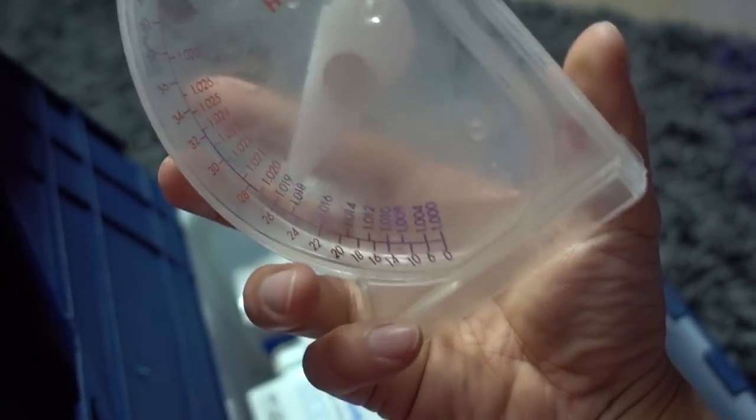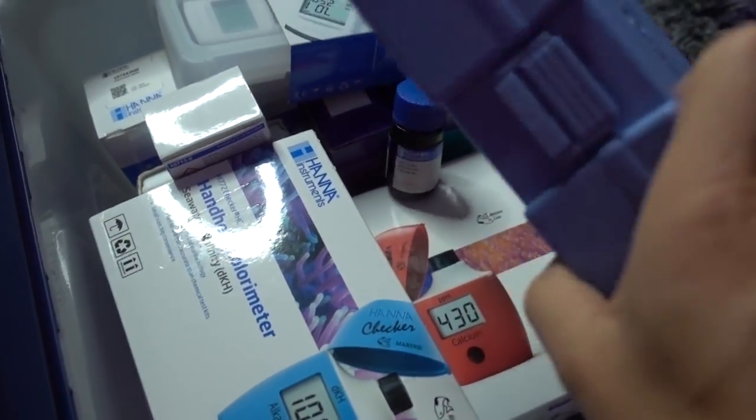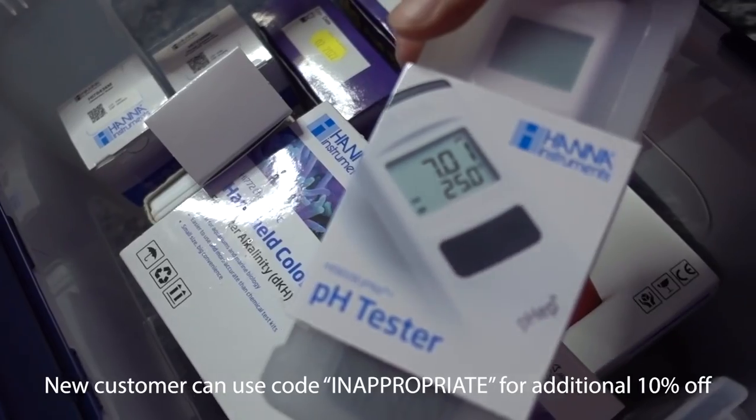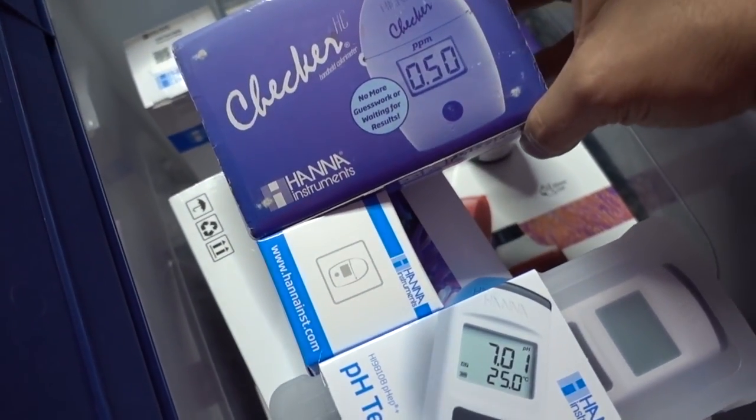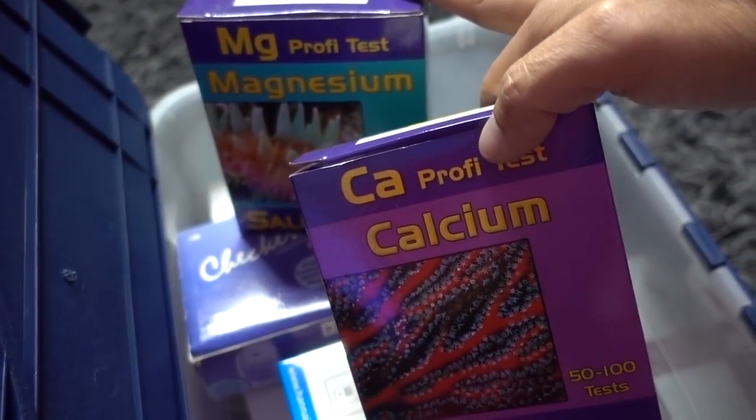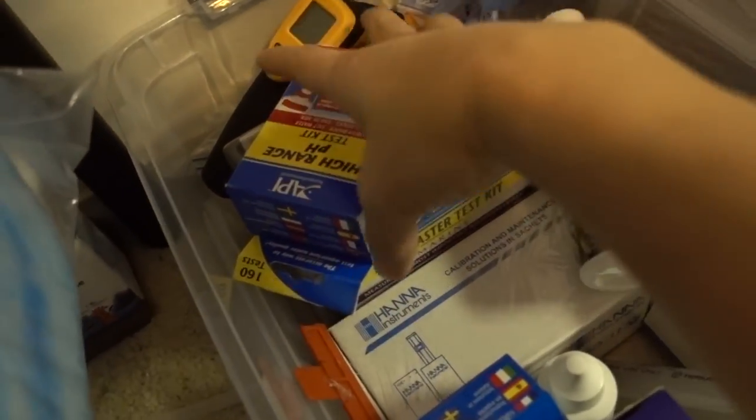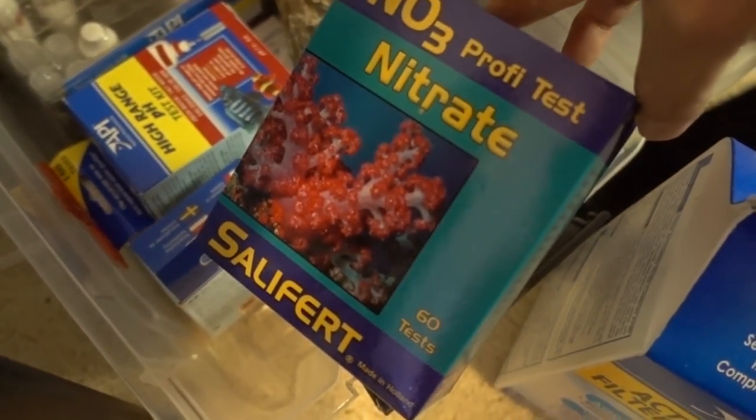First of all, you know it's quality when I have a hydrometer in the test kit box. Now, that aside, I do have a refractometer, Hannah ALK and calcium checkers, the Hannah pH tester, the phosphate checker - this is really old actually - and also magnesium and calcium test kits from Salifert. Those are my A-team in terms of test kits.